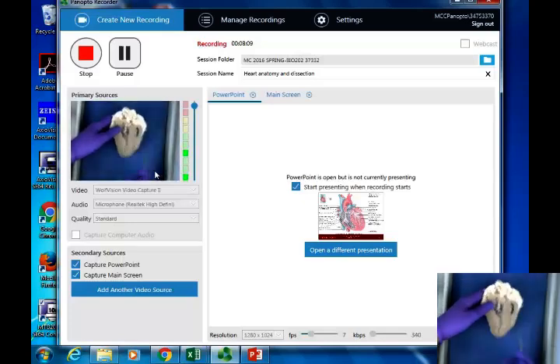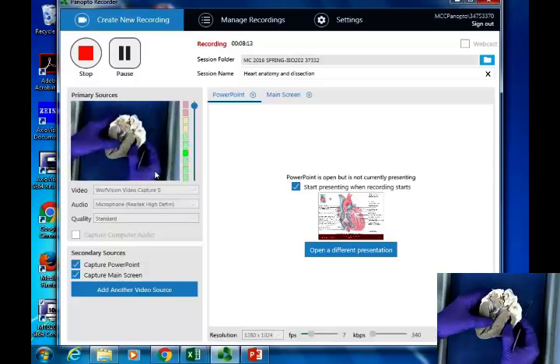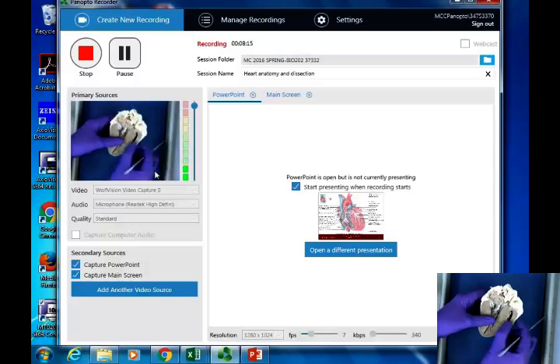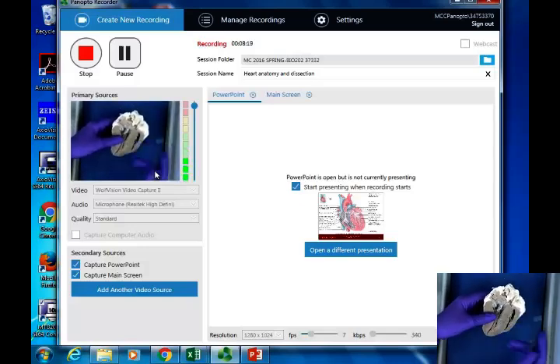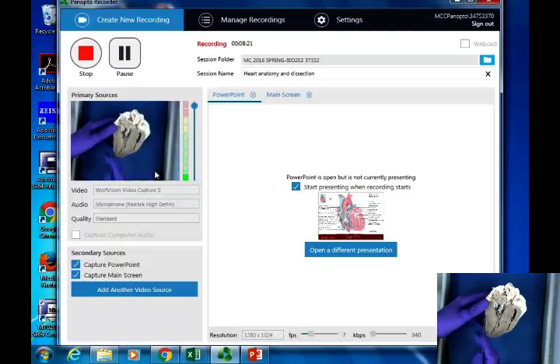So if we look inside the heart, right, here we see two long chambers. So you can see this one over here on the right side, at least on the viewing angle, what we have is a thin wall, and over here we have a thick wall. So in truth, this is the left ventricle through here, and this is the right ventricle over here instead.